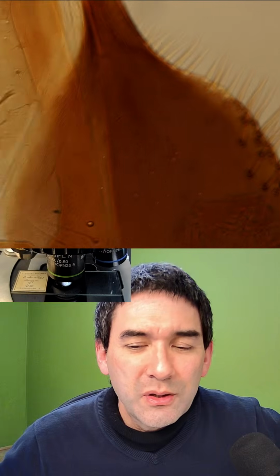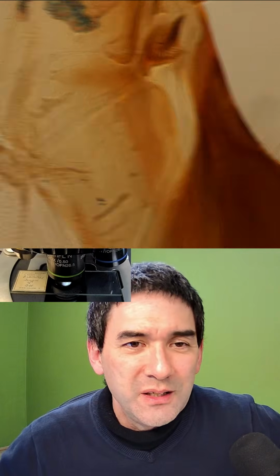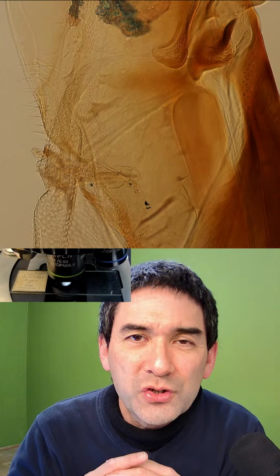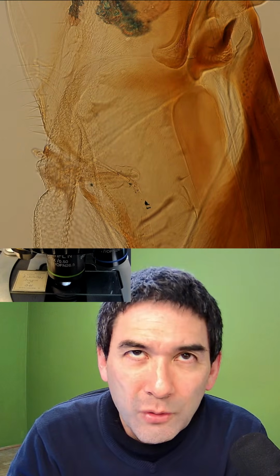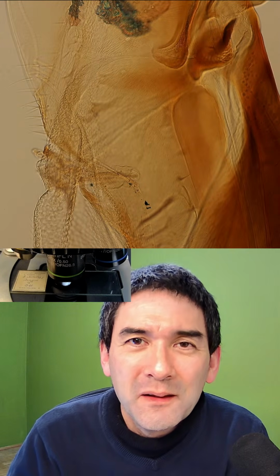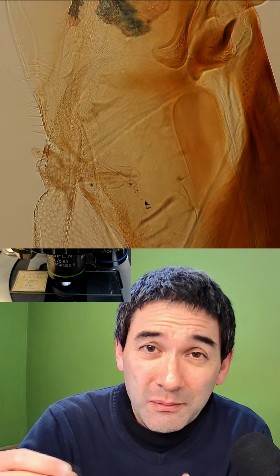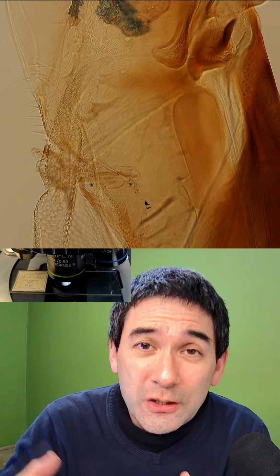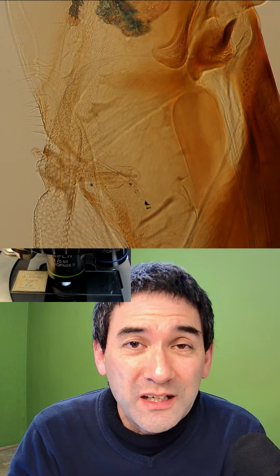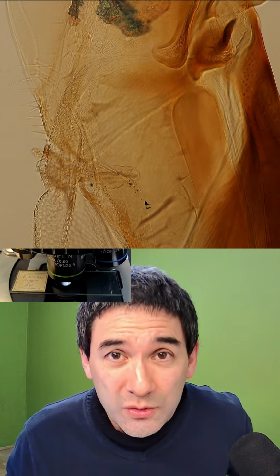It's actually quite interesting because we were talking about some of the more toxic chemicals used in biology. There used to be a solution called Hoyer's solution, and this was used as a so-called clearing agent. Basically, if you had very dark and dense specimens, you added this solution, and it kind of cleared the specimen. There's only one problem with that: this solution was very toxic and acted like a drug. However, back in the 19th century, people used these things.